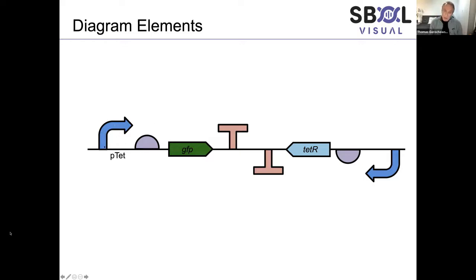So this is a promoter that's on the forward strand of the DNA, whereas this one's pointing to the left, so it's going in the opposite direction. The symbols that have been chosen for a lot of these elements are set up so that you can very easily see their orientation, either by flipping them to the opposite strand or because the shape is non-symmetric along this axis, so you can tell which direction it's encoded in.